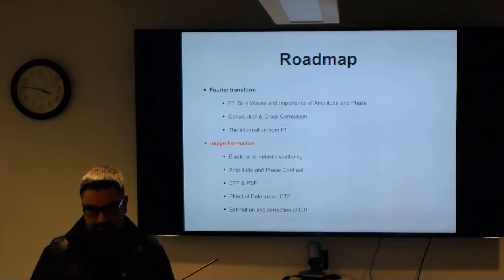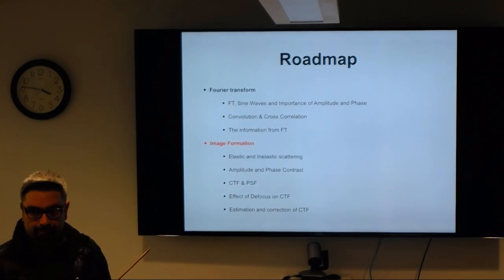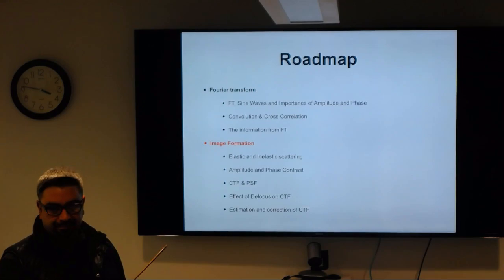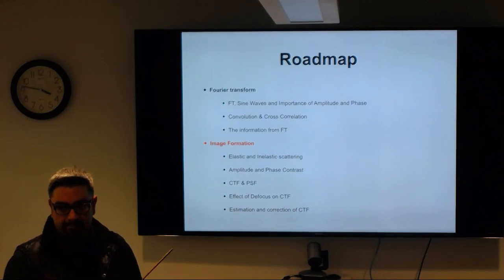If you have a very thick buffer, as we were mentioning a couple of lectures back about sample prep, let's say your particle of interest, your molecule of interest, is huge, and you need a half micron support film to sustain it. That water ring, your buffer, will be more apparent. I want to point that out.